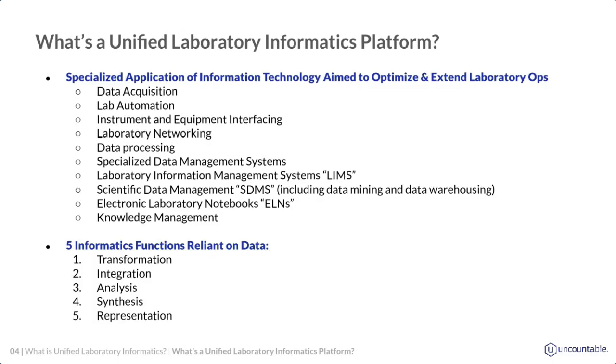So what does a unified laboratory informatics platform look like? What does a solution to all of these problems of fragmentation and lack of data utilization look like in practice? The first thing is that it looks like a lot of different things. You have to have a pretty large scope here, because if you miss one piece of the puzzle, one piece of information in the experiment story, then it's very hard to actually utilize the data in any meaningful way. You really do need everything from data acquisition all the way to knowledge management.